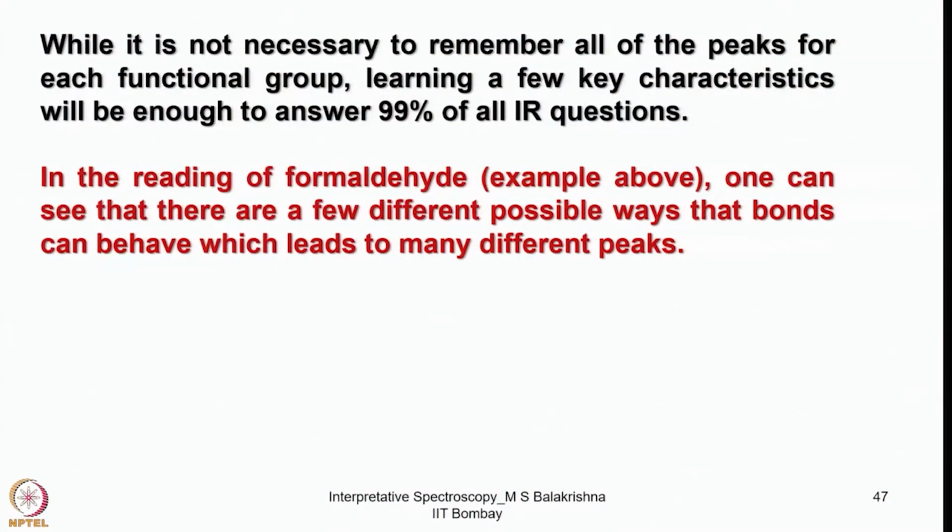So now we are discussing IR spectroscopy. While it is not necessary to remember all of the peaks for each functional group, learning a few key characteristics will be enough to answer 99% of all IR related questions. I showed you a few IR spectra in my last lecture. If you just look into it, you can identify certain functional groups' presence and also the fingerprint region.